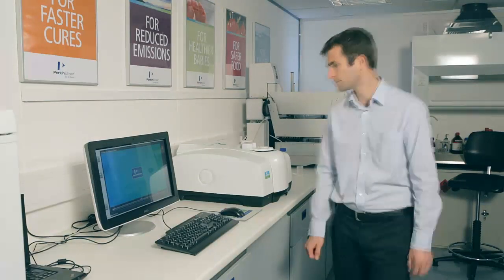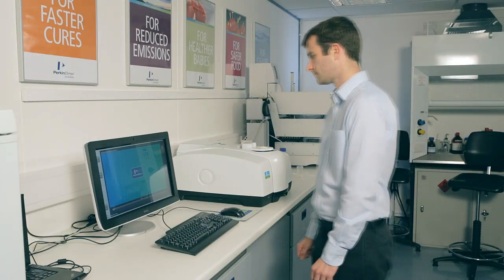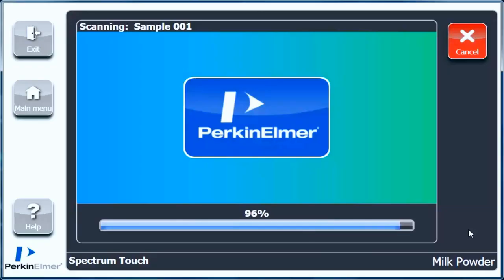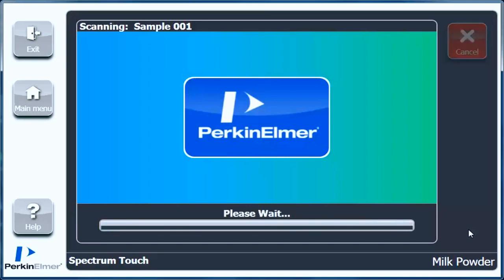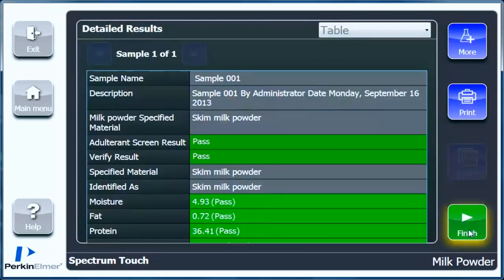The next screen displayed is the results screen. Here we can see that the sample has passed the identity check, all the quantitative parameters are within their expected values, and there are no adulterants detected.